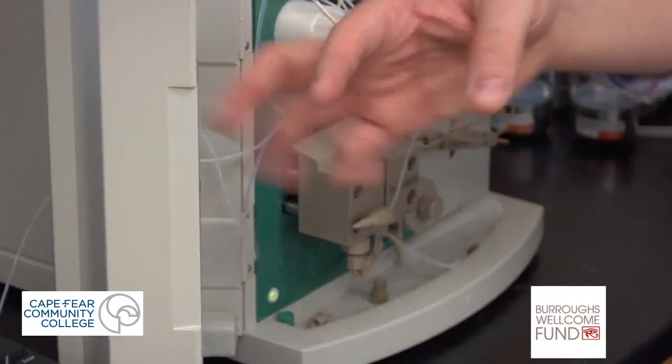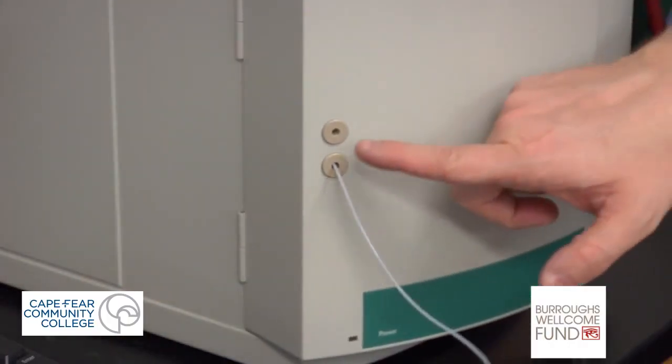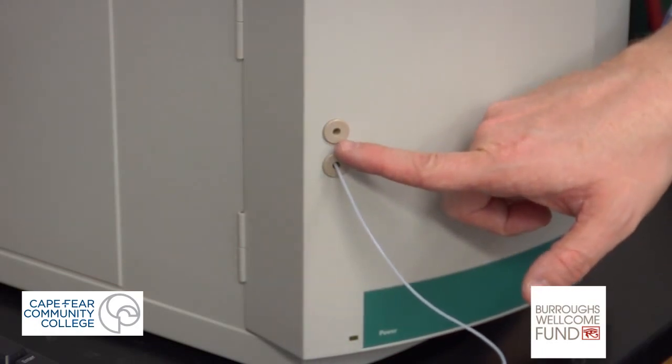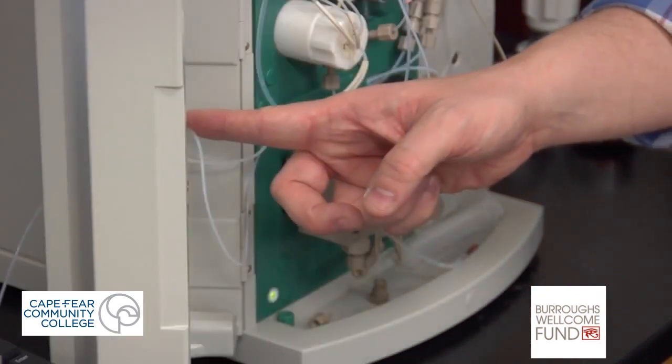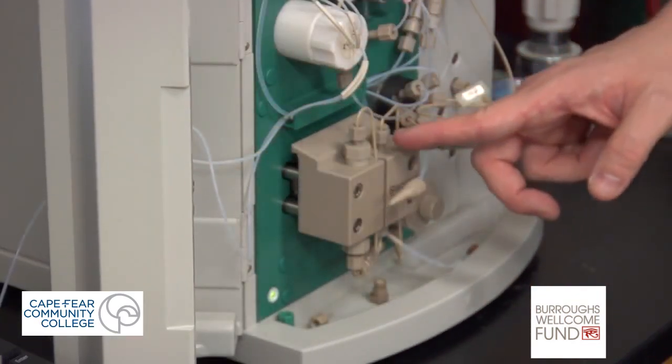The sample will come through the front door, right? So there's going to be the entry port for your sample. The sample will go through this tubing on the inside and go into what we call a pump.